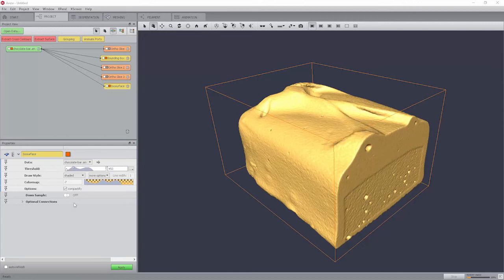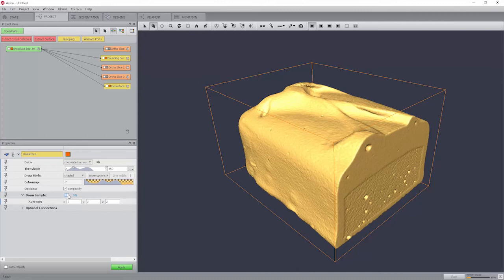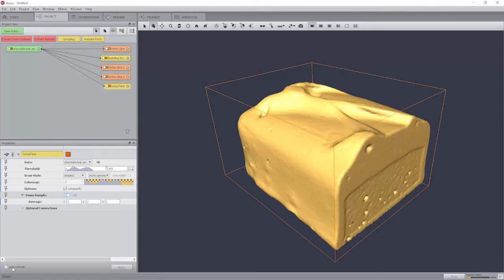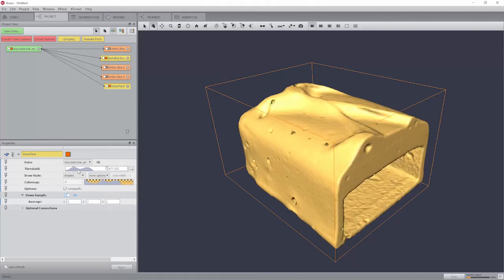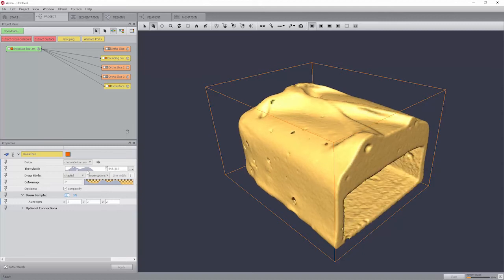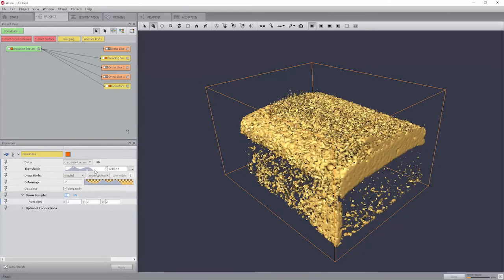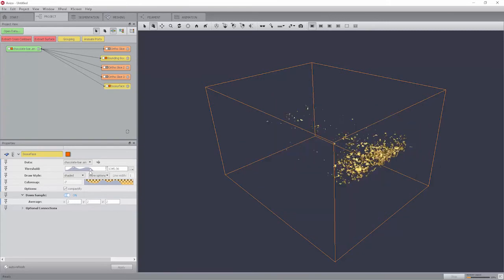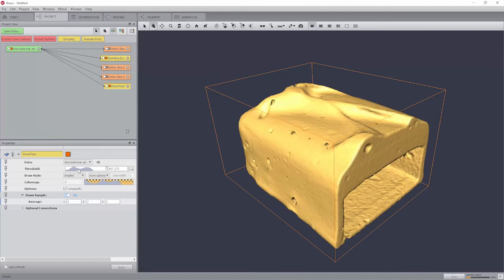Since computing the ISO surface may require some time, you may use the option Downsample to obtain a faster preview and thus test different thresholds. If you downsample enough such that the computation is very fast, you may use the button to interactively search for an optimal threshold. When you have found it, you may then disable the downsampling option to compute the full resolution ISO surface.